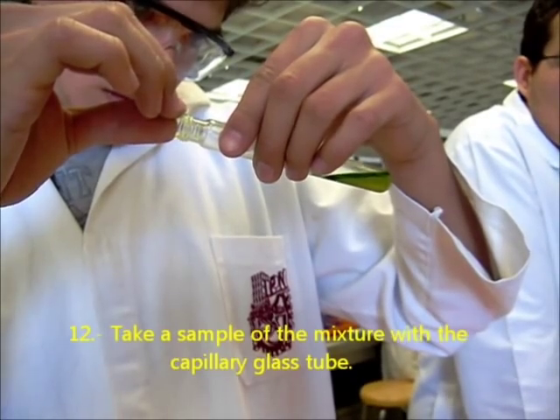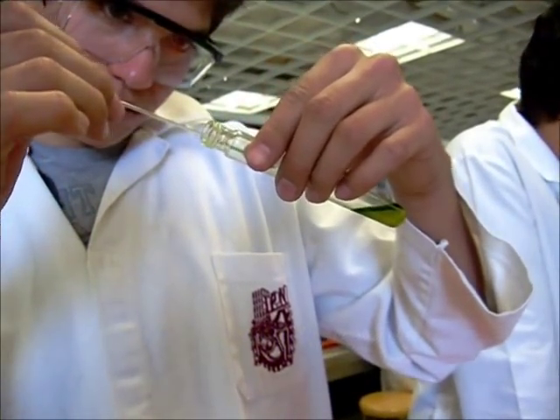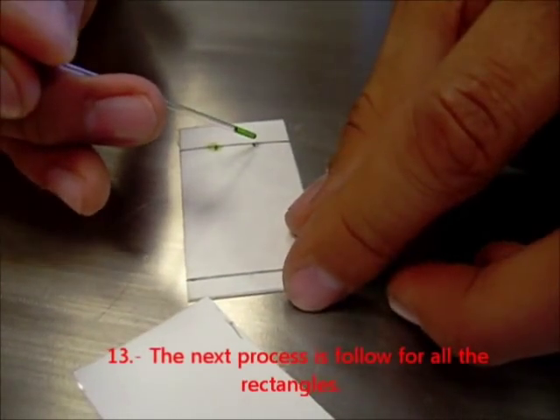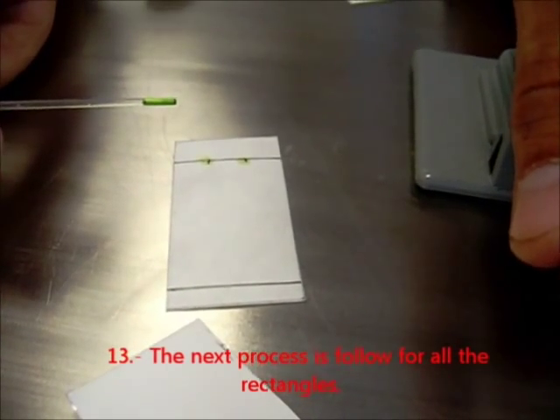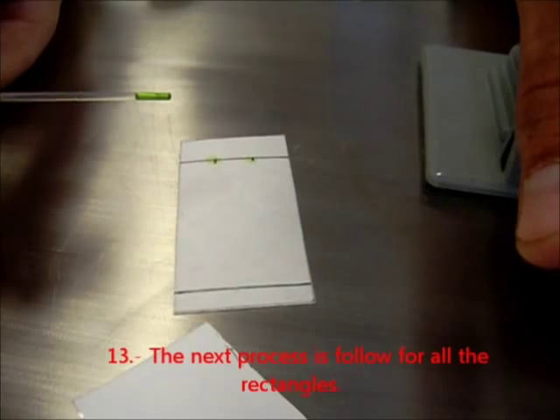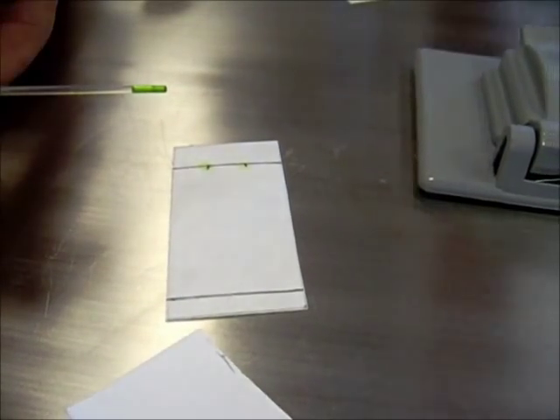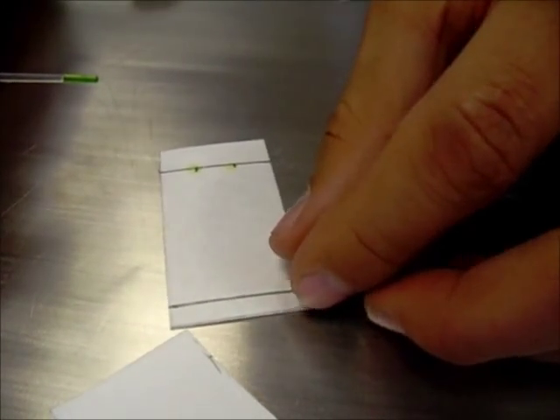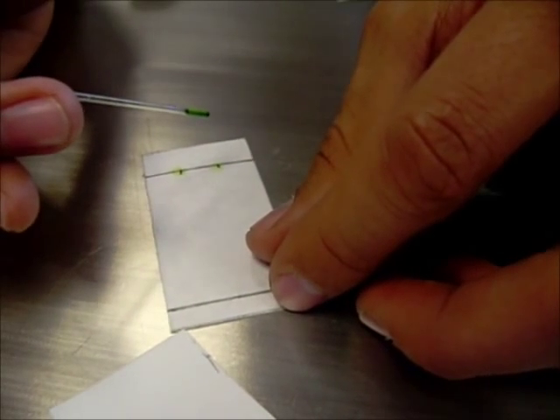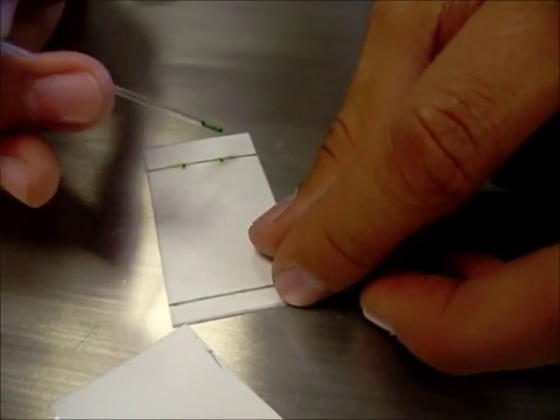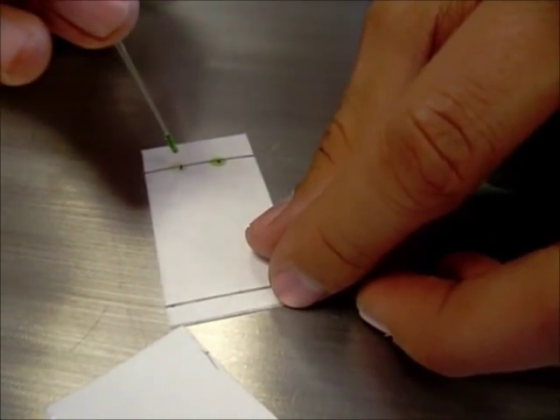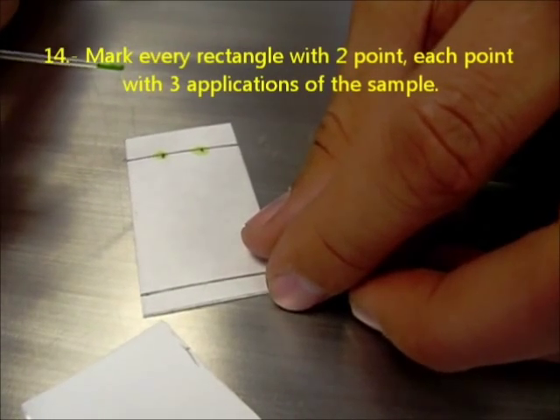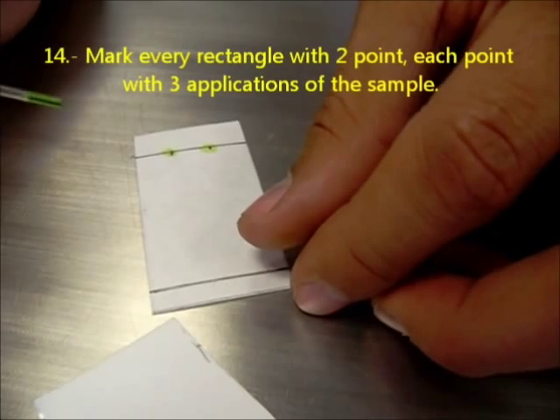Take a sample of the mixture with the capillary glass tube. The next process is followed for all the rectangles. Mark every rectangle with two points, each one with three applications of the sample.